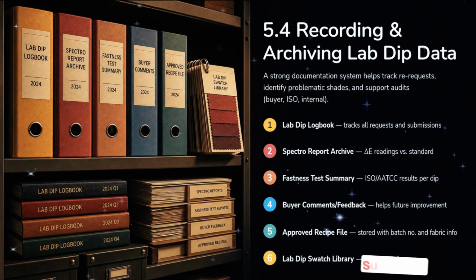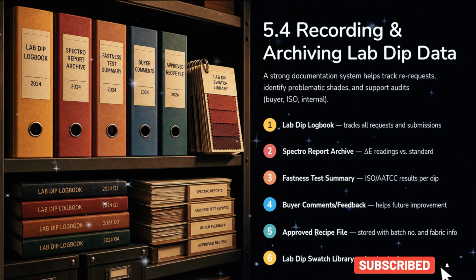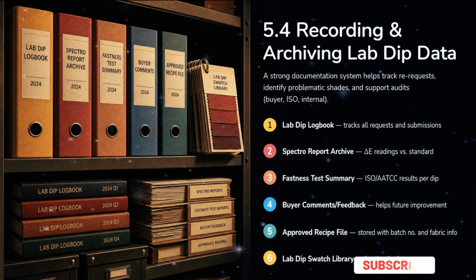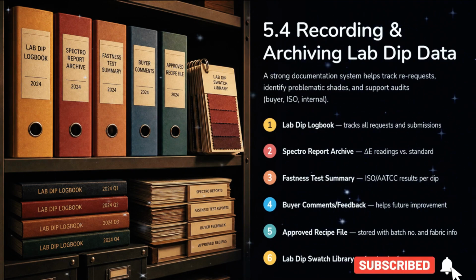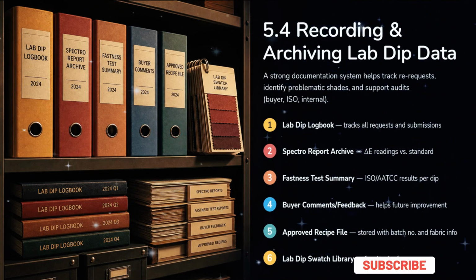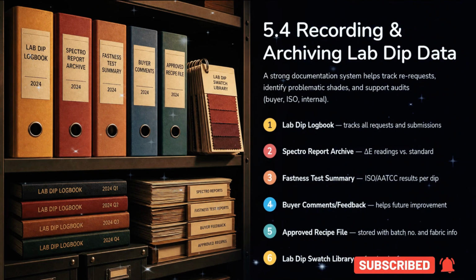Section 5.4 focuses on recording and archiving lab dip data. A strong documentation system ensures traceability. Key records include the lab dip logbook, spectral report archive, fastness test summary, buyer comments/feedback, approved recipe file, and the LabDip swatch library.